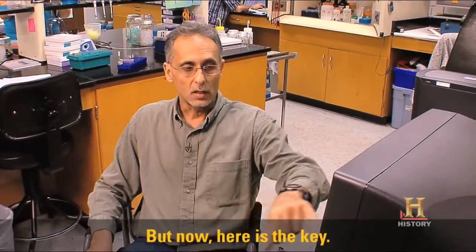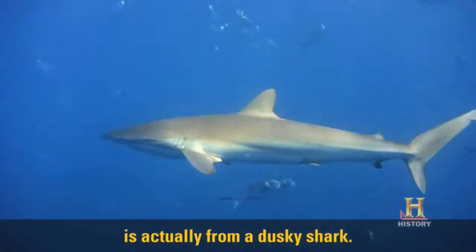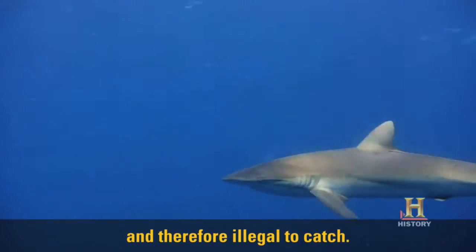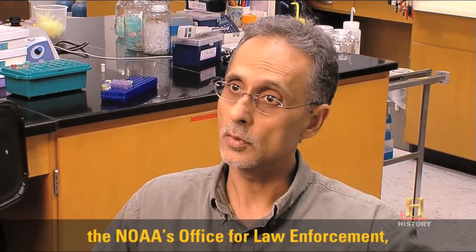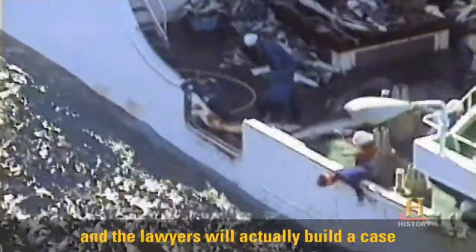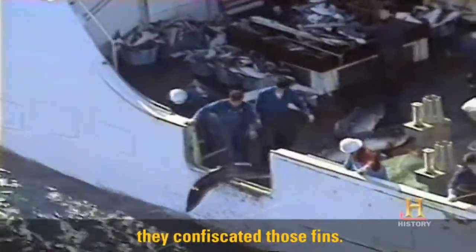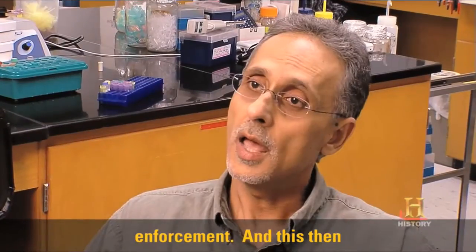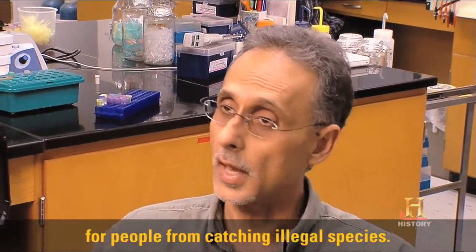But here's the key: the band you see over here is actually from a dusky shark. Dusky sharks are protected and therefore illegal to catch. So the next step is that I will write an affidavit for NOAA's Office for Law Enforcement, and the lawyers will actually build a case against the individual from whom they confiscated these fins. We are providing the teeth to law enforcement, and this then acts as a deterrent for people from catching illegal species.